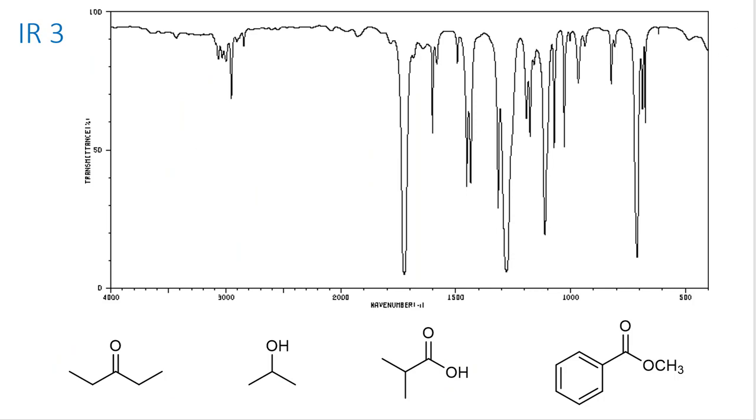Let's take a look at this example. See if you can figure out which of the 4 structures this infrared spectra corresponds to.